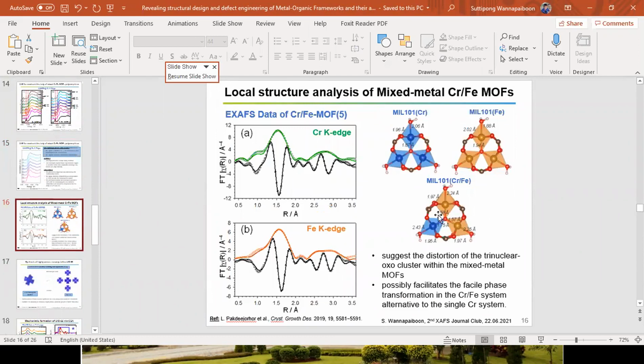So one thing here: if you consider this obtained model after the fitting of the X-ray data, you can see that the shrinkage deviation only happens for the bond connected to the oxygen inside, which is the mu-oxo bridge oxygen. So the distance here is shortened, but the one with the organic carboxylate ligand is getting elongated. So in the end, you somehow compensate, and the crystal structure is similar to what you get from the MIL-101 structures. So the XRD pattern is still the same, but only the deviation between the organic linker and the metal node has changed. Yeah. Thank you very much.